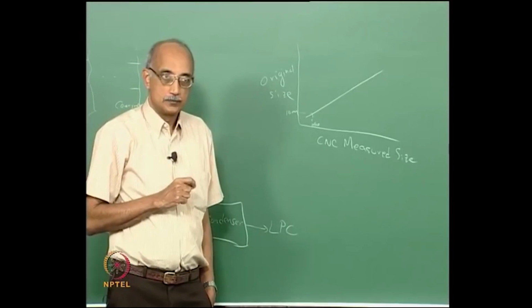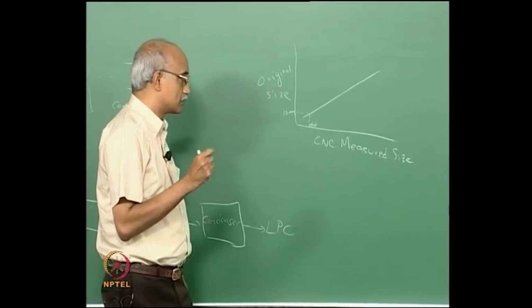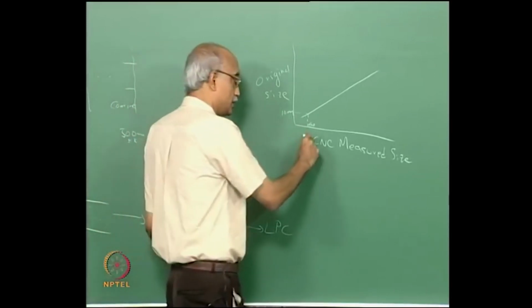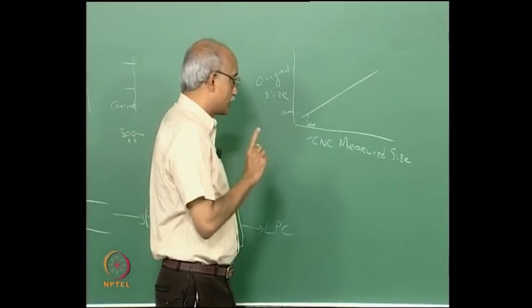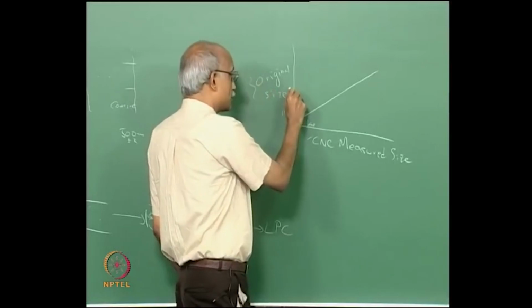Yes. So how does the calibration graph is drawn, sir? Well, again, there are really two ways to do it. The calibration can be theoretical, because what you're really measuring is only this, right? And you're still estimating this. But you can actually theoretically calculate what this size was.